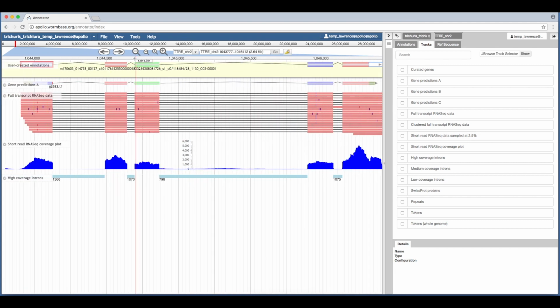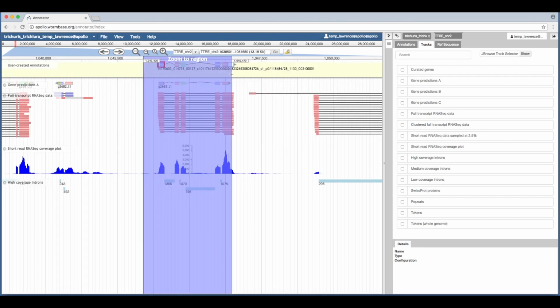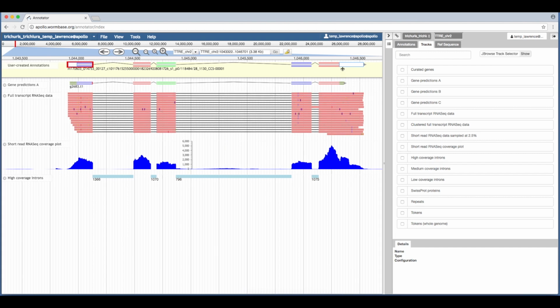I will check over a final time, make sure that I've had a look at all of the reads, and I'm sure that this one is the most accurate. And I am happy with that.